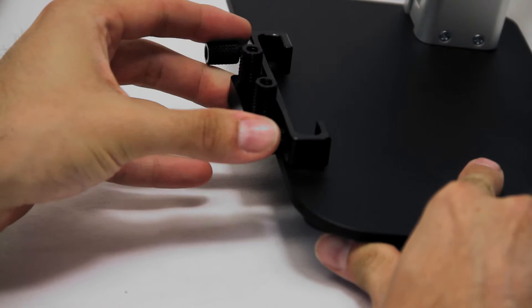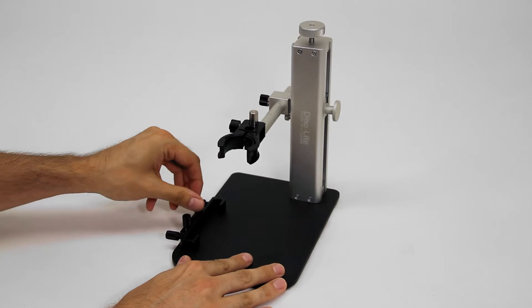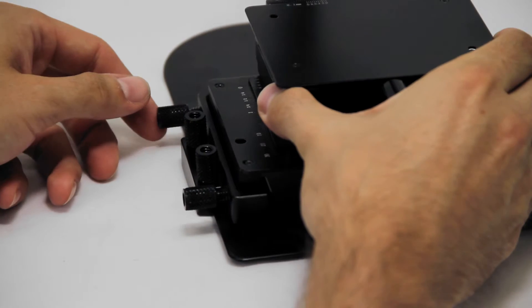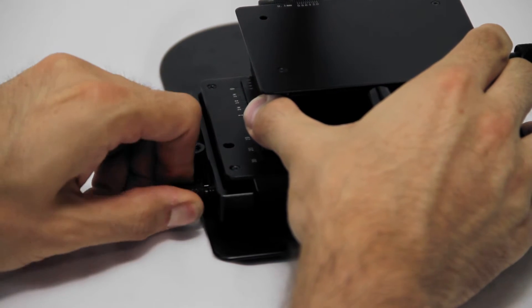After fitting the S2 clamp onto the stand, secure into position using the vertical set screws. Place the leg of the MS-15X into the clamp and secure with the horizontal set screws.